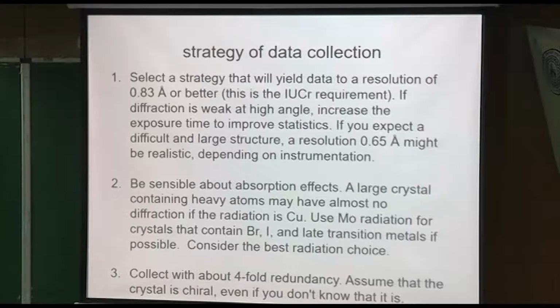I already mentioned last week about absorption effects, so you have to take that into consideration too. If you have a heavy absorber and you're going to be using even molybdenum radiation, don't use too big of a crystal. Keep it small. A half of a millimeter crystal might just actually block the X-ray beam.